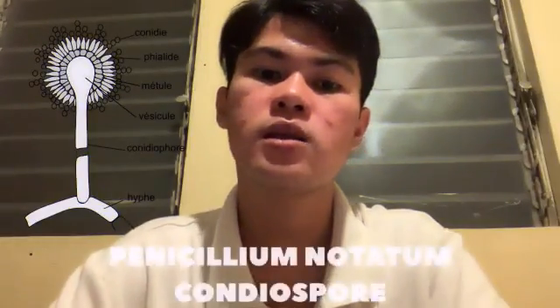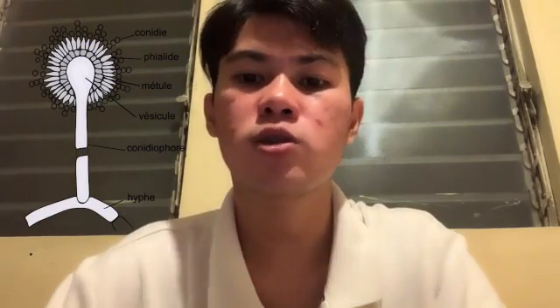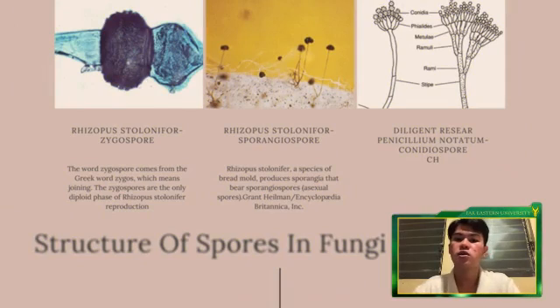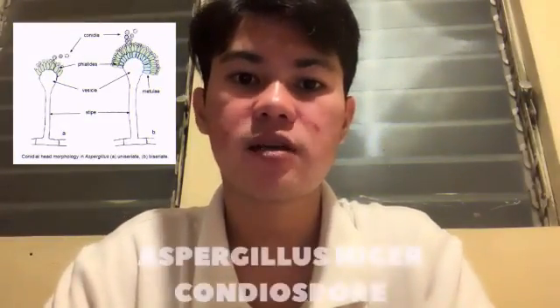In terms of Penicillium conidiospore, its mycelium gives rise to simple and long conidiophores with branches about two-thirds of the way to the apex, in a fashion that is typical of a broom. The conidiophore branches terminate in a cluster of conidiogenous cells known as phialides that produce chains of conidia at their apex. Let's jump into Aspergillus niger conidiospore.